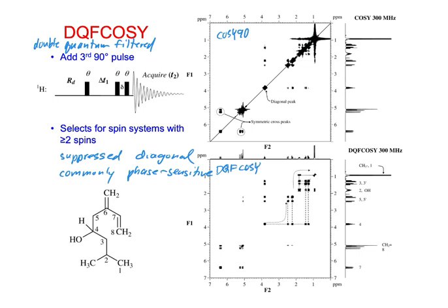and the diagonal, but what we see along the diagonal here is it can be pretty messy. And notice where we have this big doublet here for the two. Well, actually, we looked at this before. I think that it was almost like a triplet. We did this in one of our... Yeah, and when they did different solvents, remember they came apart as two doublets.